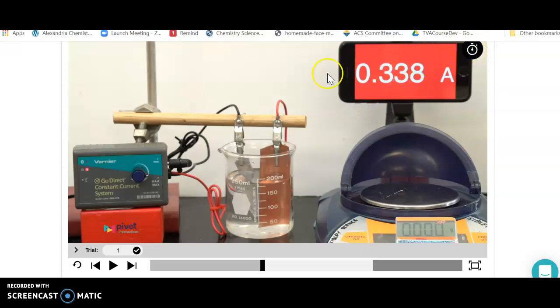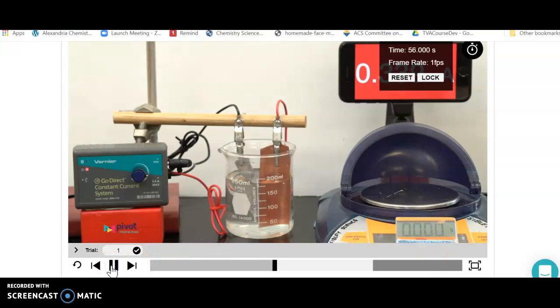As soon as they put these two strips of metal into sulfuric acid, you're going to have to come up and hit the timer. Before you do that, record the amperage. The amperage is the number of coulombs per second that we are going to put into this electrolytic cell. Get the stopwatch, hit reset, record your amperage and mass, then hit play.